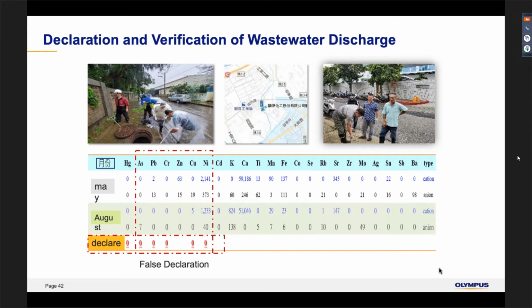So what is the range of analysis? In case of high concentration, how does the instrument behave? I think it's a characteristic of the XRF. It can simultaneously measure the major elements and the trace elements. As you can see in this figure, we can read calcium at almost 60,000, and the other elements at maybe 2,000.